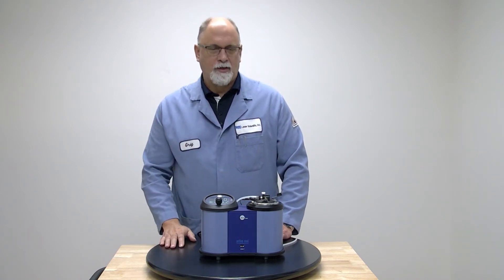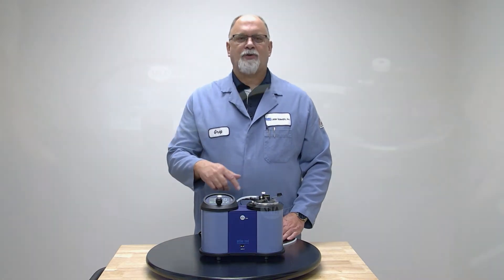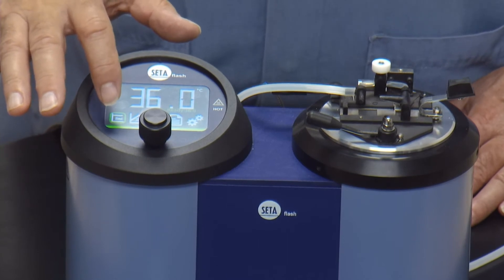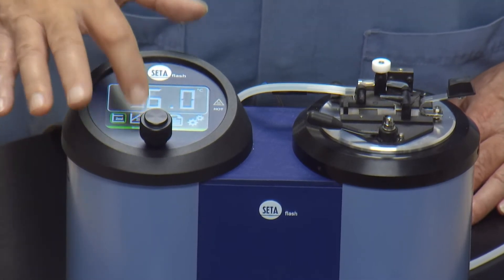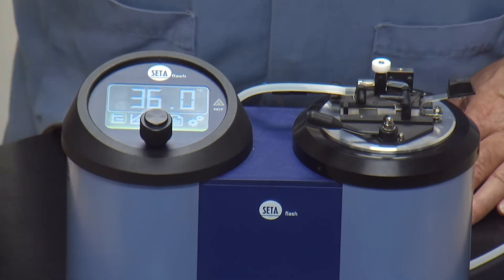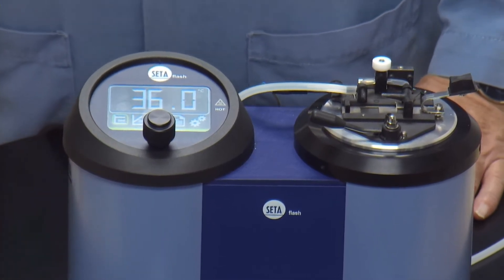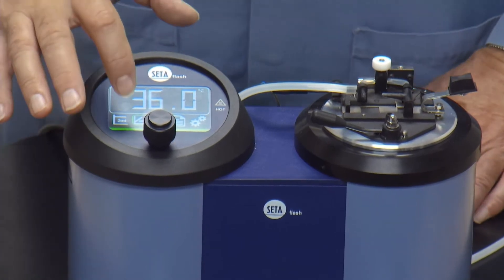Once you have that on and you're ready to do a test, it's very easy with this instrument. It is a touch screen interface — you can use the touch screen and the control knob to do any type of function. This instrument has two test methods: a go/no-go test called the equilibrium method, and a ramp method. The equilibrium method runs ASTM test D3828, and the ramp mode runs ASTM 7236. An information bar on the bottom of the screen tells you which mode you're in.